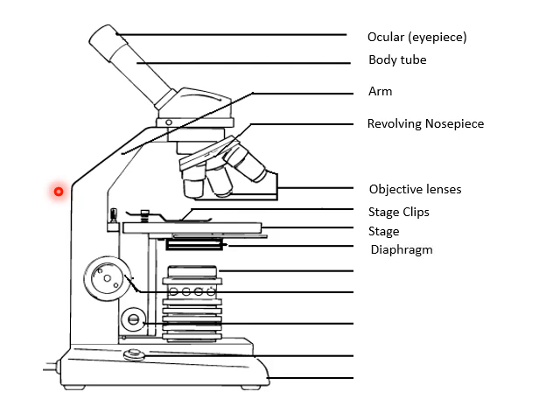The next thing on here is the diaphragm. So right in here, now different microscopes change their light different ways. Here what we have is like this little lever that you can slide back and forth, and it's going to change the amount of light that's going through.